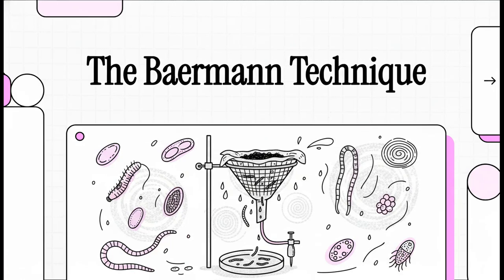You know, in parasitology, sometimes just finding a parasite isn't quite enough. For the really critical research, for the tough diagnostic cases, we need live, viable organisms. So today, we're going to do a deep dive into a classic, and I mean truly indispensable tool that's built for exactly that, the Baermann Technique.